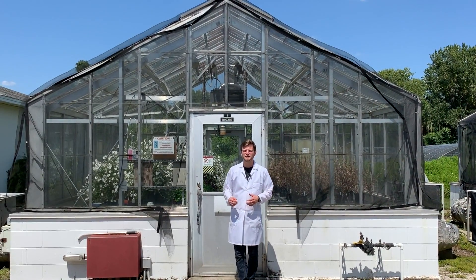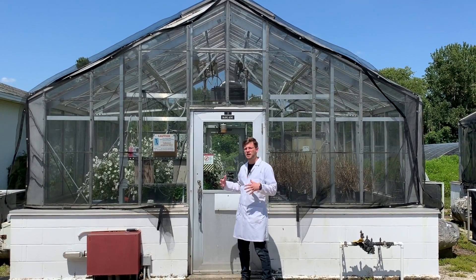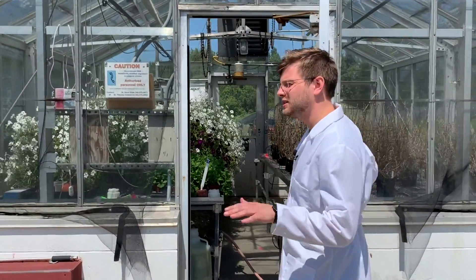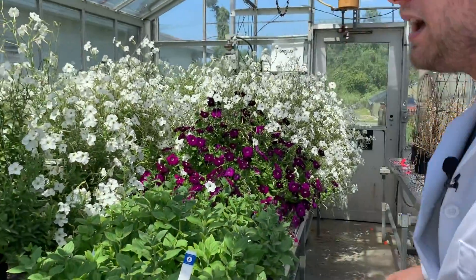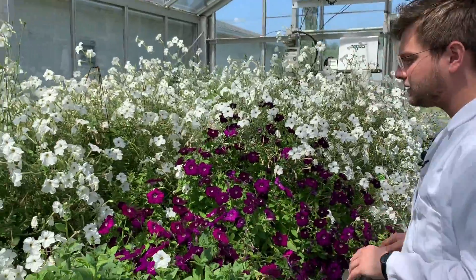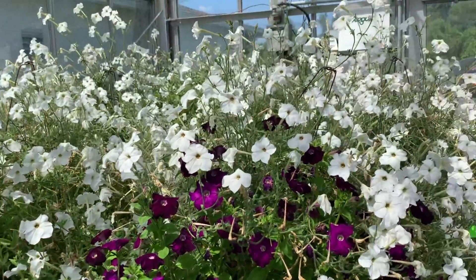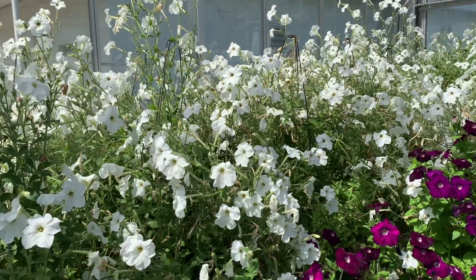We have a couple different types of greenhouses down in our facility. This one is our smallest type but it's the most environmentally controlled. Inside our greenhouse is both air conditioned and heated to keep our flowers always at about 70 degrees Fahrenheit. On this side we have beautiful growing petunia plants. We use the purple ones for different types of experiments than we use the white ones for. The white ones are extremely potent and very smelly, so we use these for all of our scent treatments.